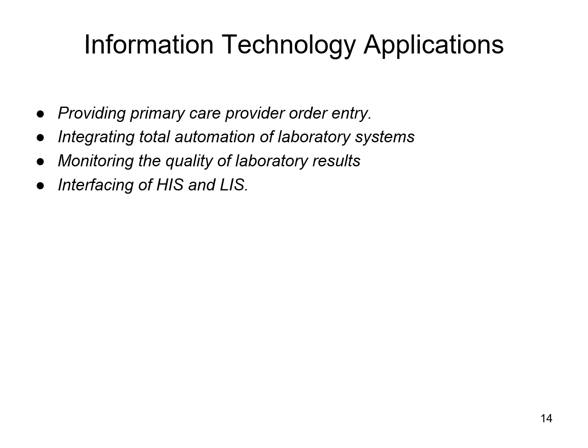These systems can also have a way to allow you to monitor those results. There's a lot of features built into them that help to give quality checks and monitoring of those laboratory results, even down to monitoring your quality control and being able to see that within your laboratory information system. And so they also will be involved in interfacing. So your analyzer, once it's done running those tests, the interface will allow it to communicate to your laboratory information system, which will also communicate those results to the healthcare electronic medical record.